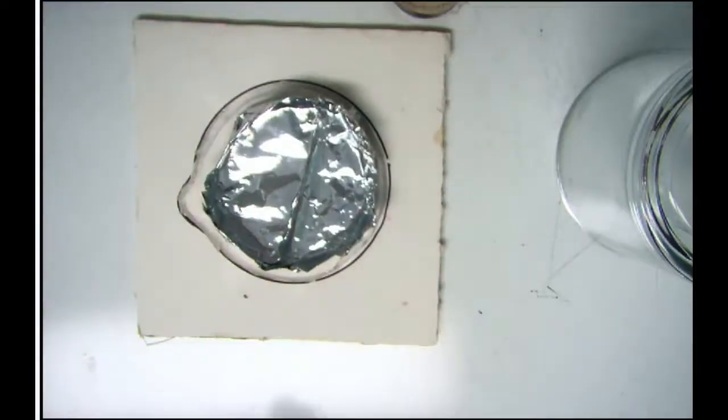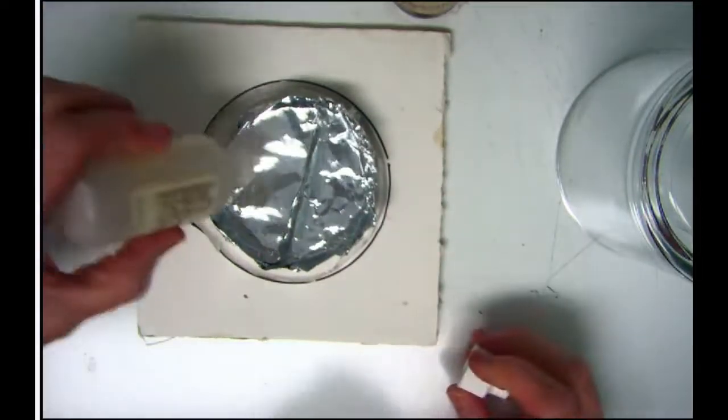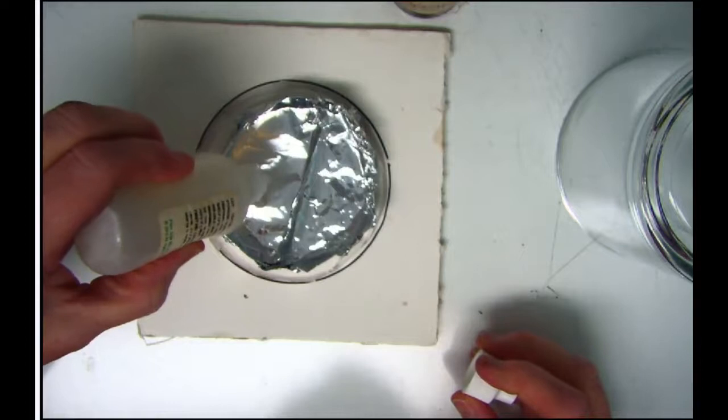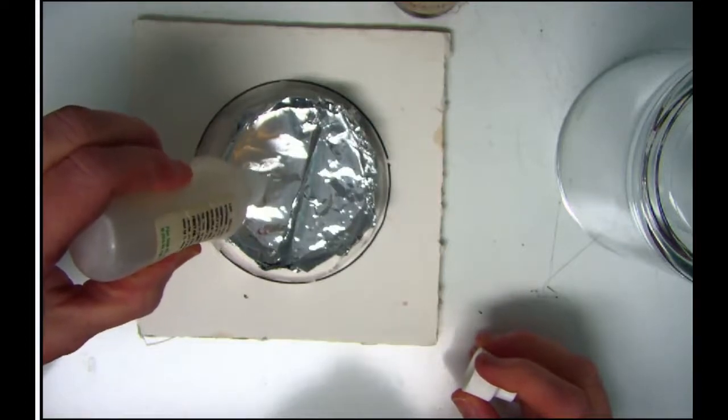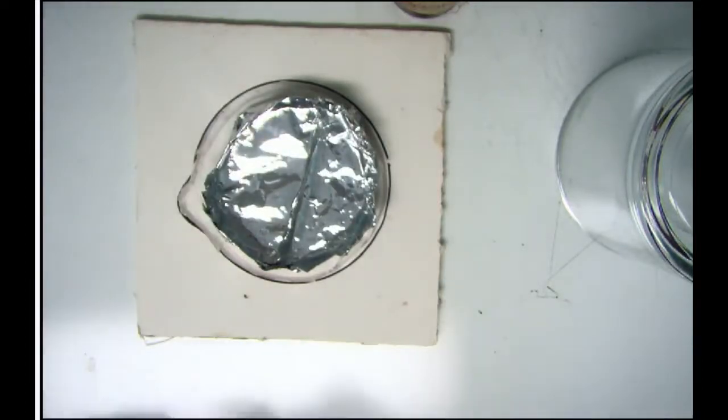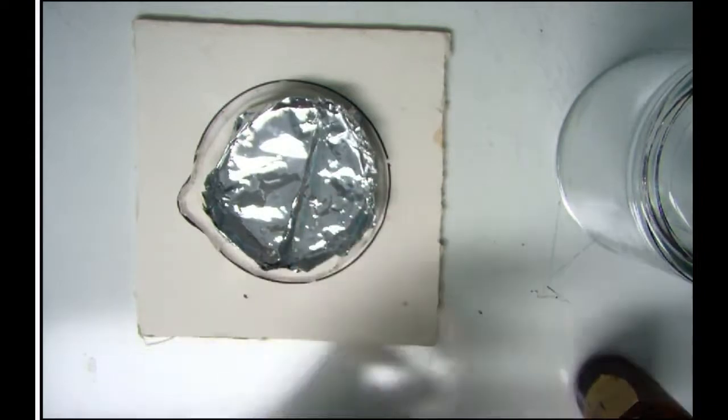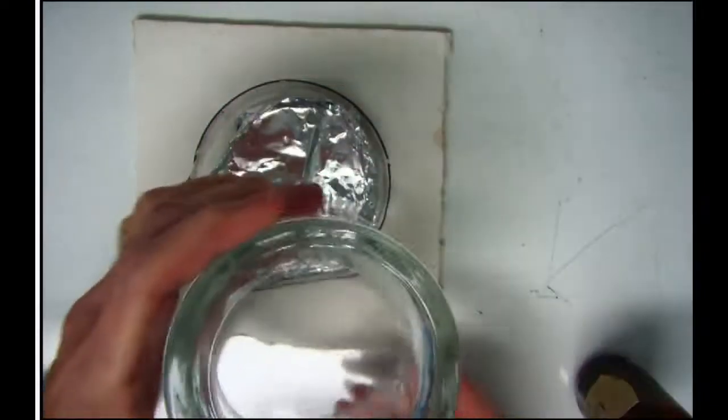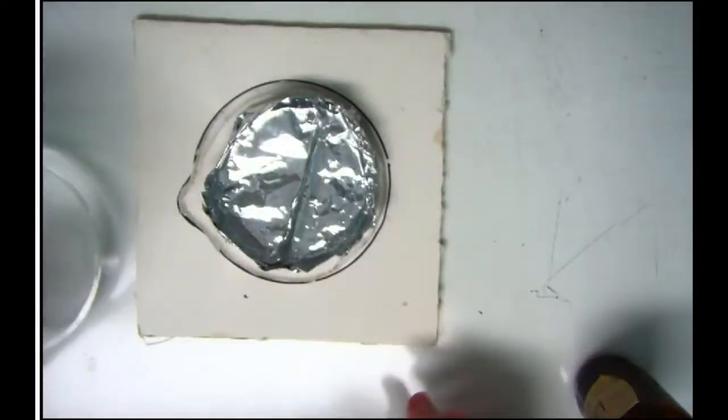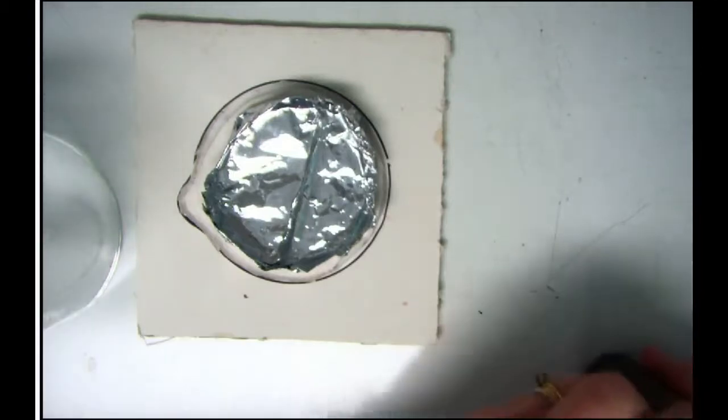All right. So what you're going to notice is that there is a few clear colored drops. You can't even see them there. And then there are going to be some clear colored drops that I'm going to put on this side. All right. As soon as I do that, I'm going to cover it with a glass jar, and you're just going to sit and watch what happens.